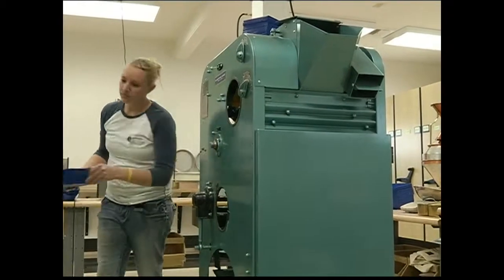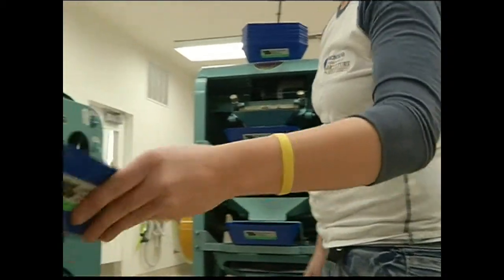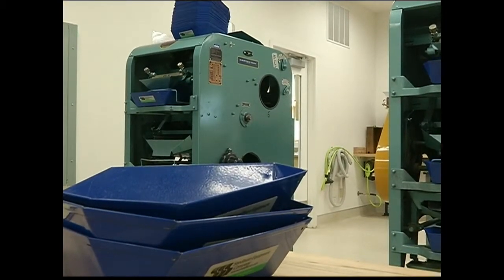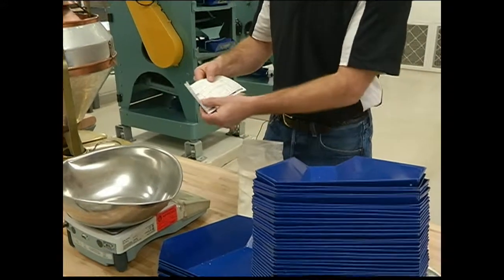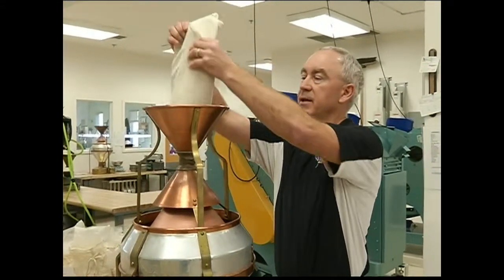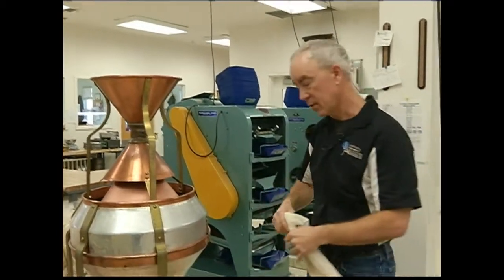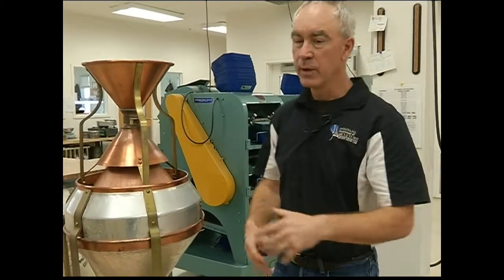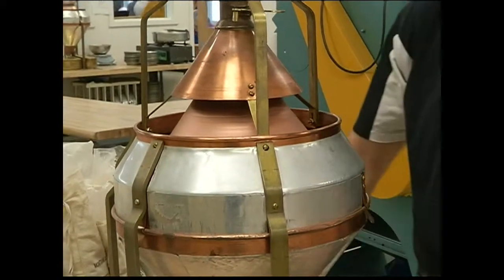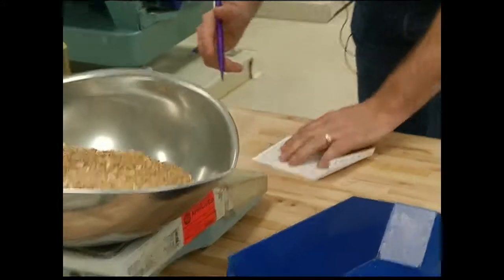As farmers harvest crops and offload them into a bin, they need to determine the quality of the samples. Producers, grain mills, and commodity brokers all need to know the quality of grain as it moves through the system. So the sample comes into us. It's identified as to the farmer, where he's located, and what various tests that he wants. So the first step in the analysis is we would pour the sample that he submitted to us through our divider, so we get a nice random sample of what he's sent to us. We need about a quart of grain in order to run all of our tests. So we'll go ahead and weigh that out, and we'll record those values on our ticket, and that would be the initial part of the examination.